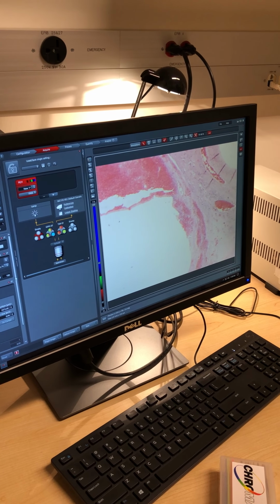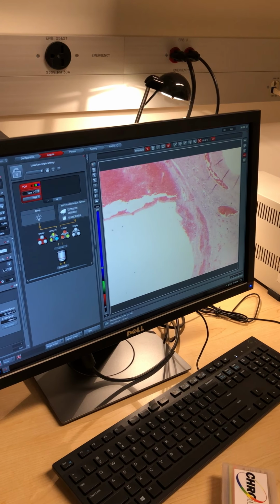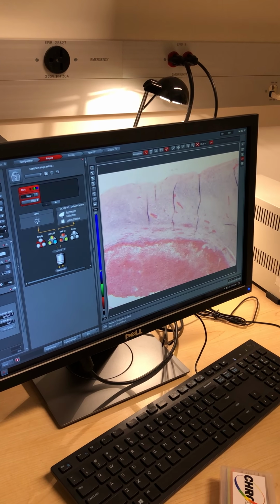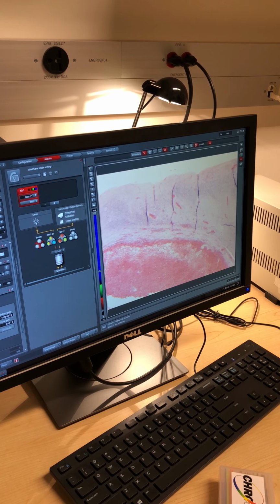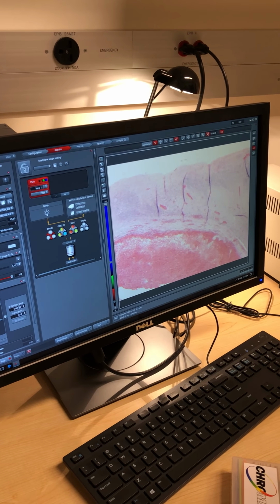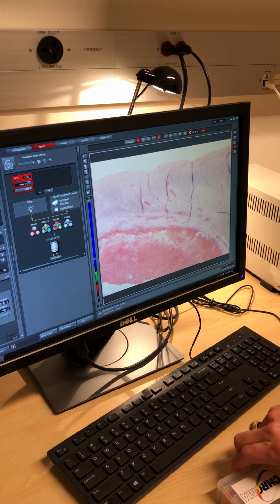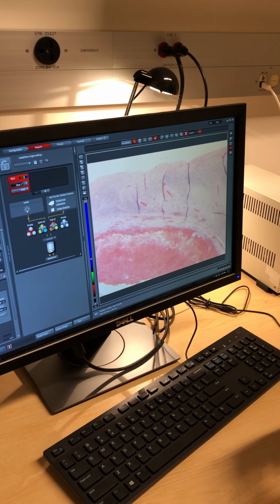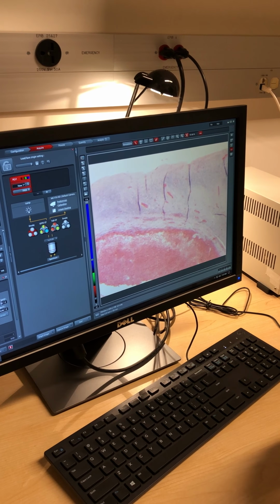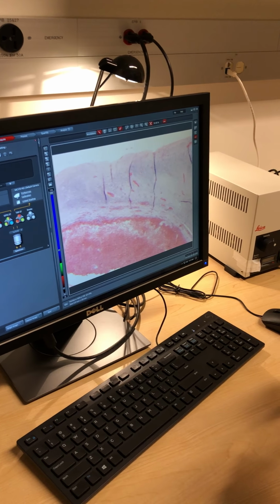So what are we looking at, by the way? I think this is, you know, kidney. Looks like muscle or something. I actually get these from customers usually. Yeah, it's H&E stain. It's fine, but there's not a lot of contrast. We need something thicker. For example, if you want to image fruit flies, right.